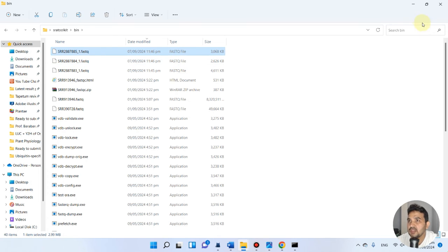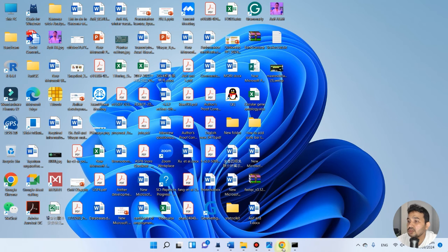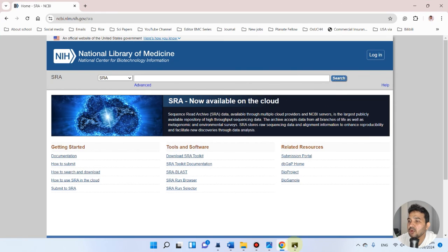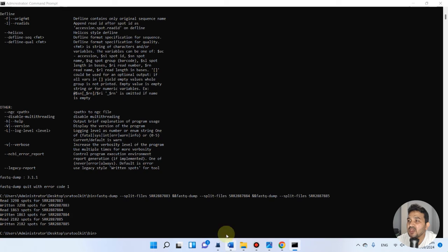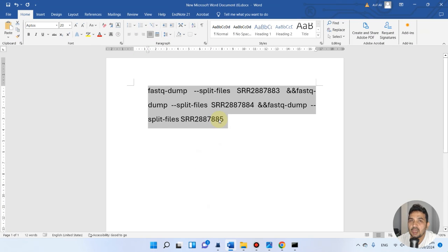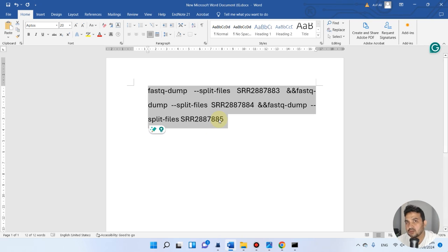In this way, you can use this command prompt in Windows to write your code. I will paste this code in the video description so you can adapt this code for your own use. Thank you.